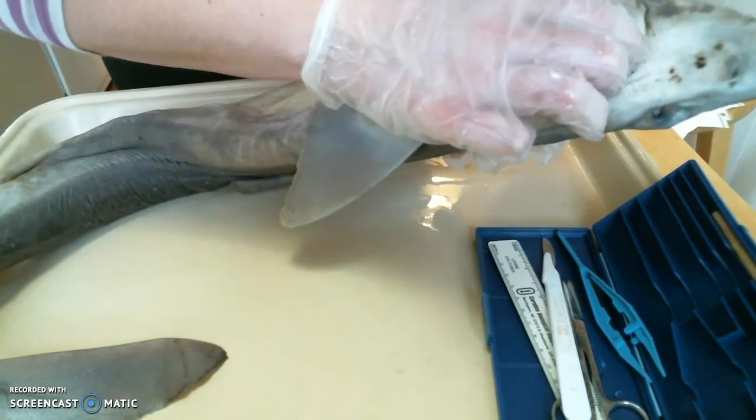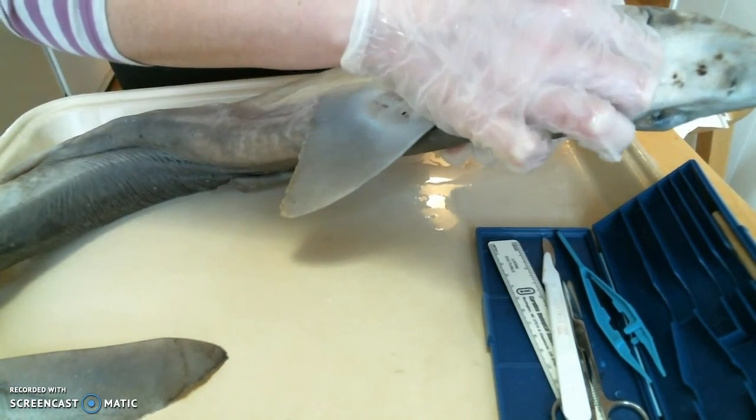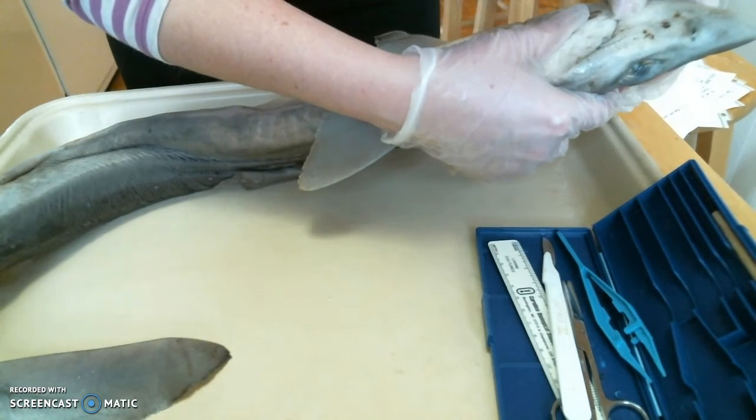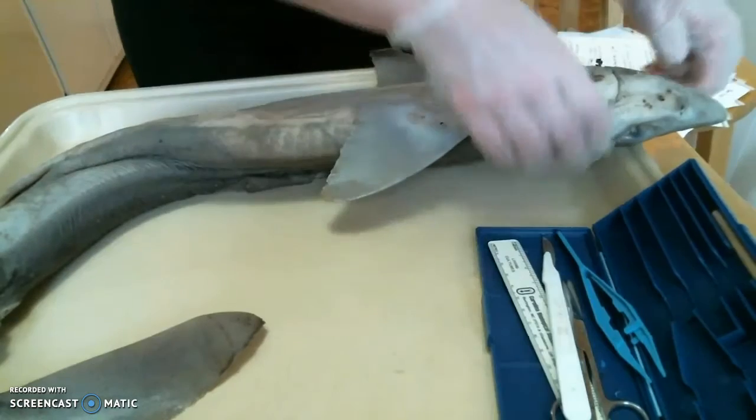It says to look at the teeth. The mouth is really hard. I don't really see a very easy way of getting to the teeth. I can see them. They're sharp. I can feel them, but you can't really open the mouth or anything.